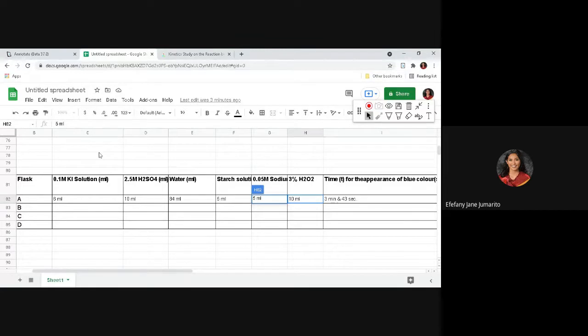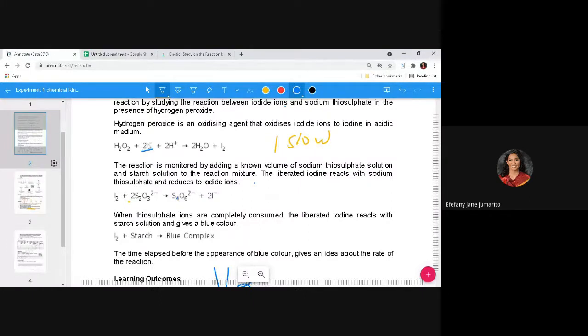Yes, it came from our potassium iodide, KI. When that dissociates, it becomes K plus and we have I minus. So this I minus came from our KI. And then we have our H plus. Where does our H plus come from? From the hydrogen peroxide? Ah, no, sorry.